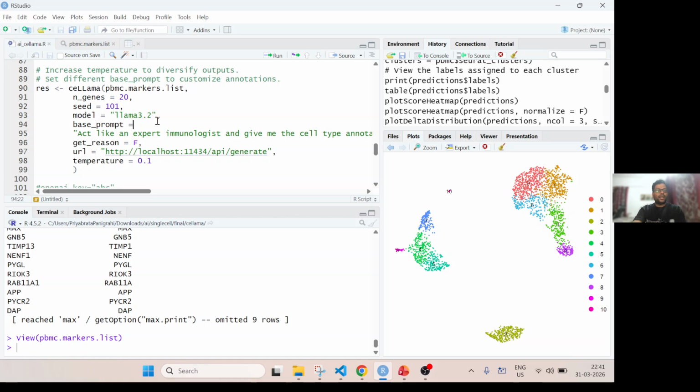So here I can say that this is my local Ollama model, and my Ollama is running on this port. When you install it, by default it runs on port 11434, so this is the Ollama URL. That means it's on localhost, running on your local system, right? That path you have to give, and you can say this is the model. Here you can pass, as I said, GPT OSS, but it will take some time to run.